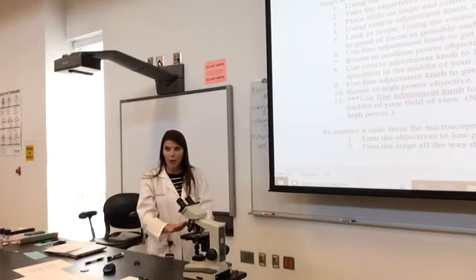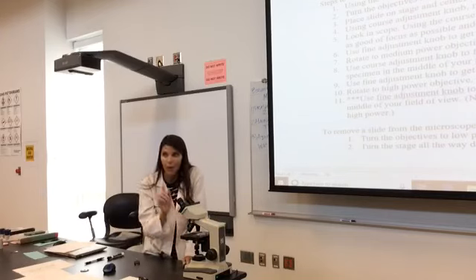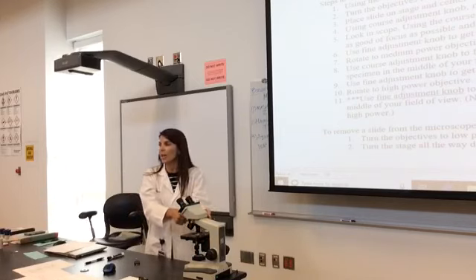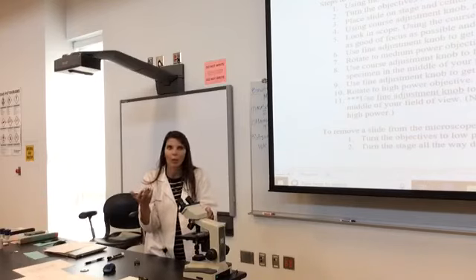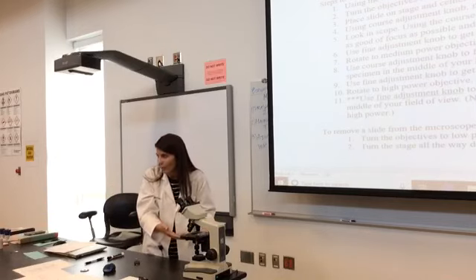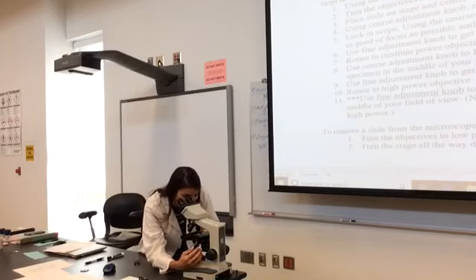So now I have it on low power, or my scanning power, and I can see it clearly. I have to take it to medium power. I do not suggest you stand back like this and switch it. Because what people say is, oh my gosh, it's gone. Like it moved. No, it didn't move. Okay, but if you watch it, you can keep your eye on it. It can't move. It's not alive. All right?